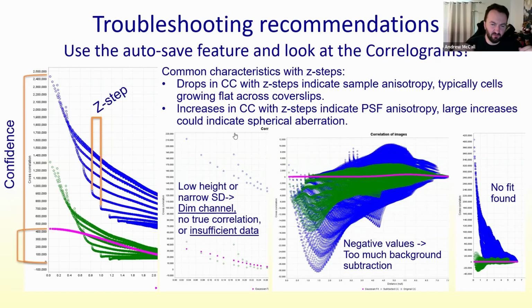I'm not going to go back right now, but if you look at the endoplasmic reticulum versus mitochondria, that is the case. A lot of the spreading out of that standard deviation was more because of the abundance of the endoplasmic reticulum and the mitochondria, not so much because they're elongated structures. But this is actually one of the things that CCC excels at, those types of structures, because there's not really a great other way to analyze elongated structures.